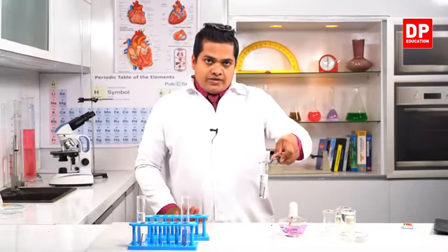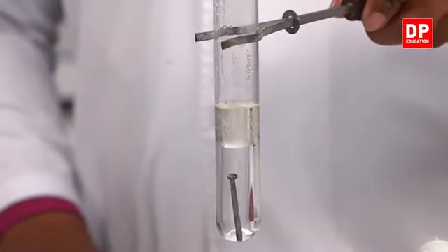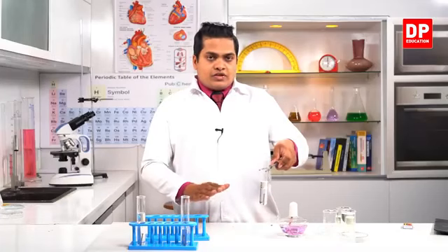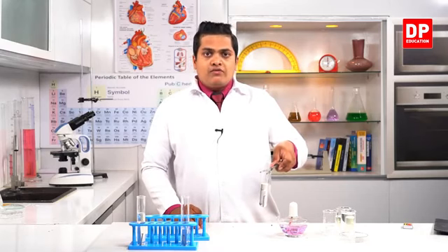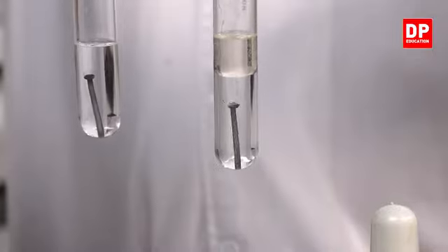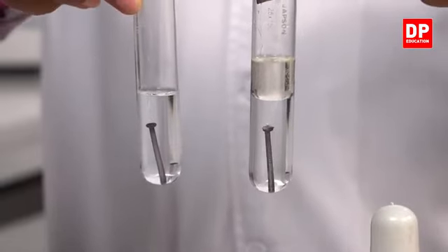So we used boiled water in this setup. And I have added coconut oil as well. So what's the purpose of adding coconut oil for these boiling tubes? You know that these test tubes or these boiling tubes are exposed to normal air. It's in our normal environment, no? And you already know that gases are going to dissolve within normal water. So if you take this boiling tube, it does not have any coconut oil layers. So here this one is exposed to the normal air in normal atmosphere.